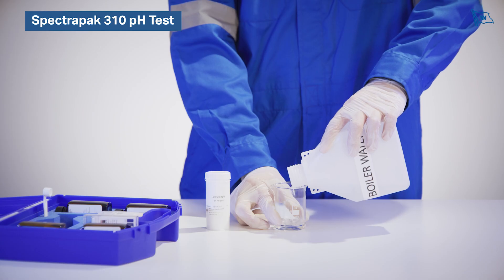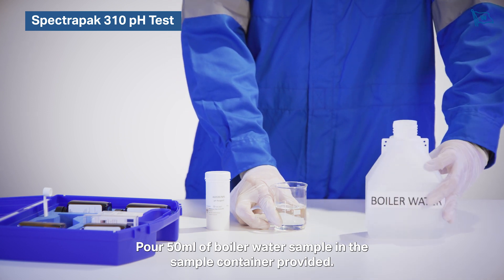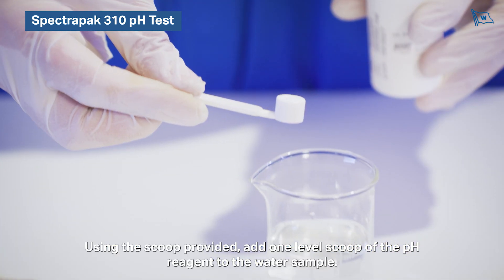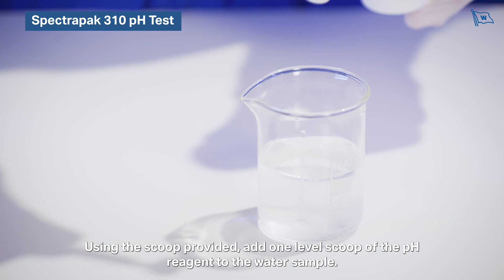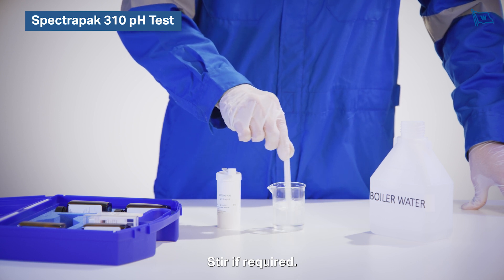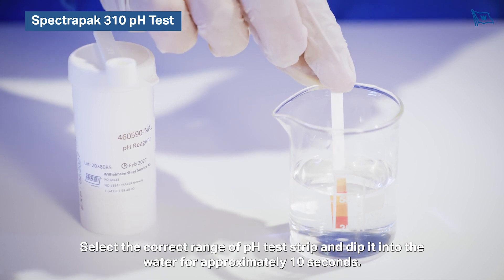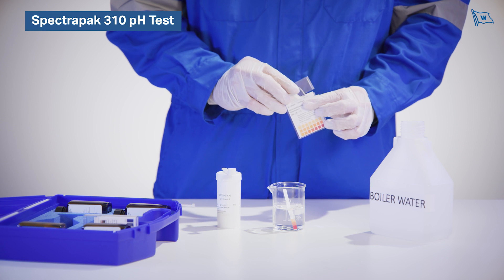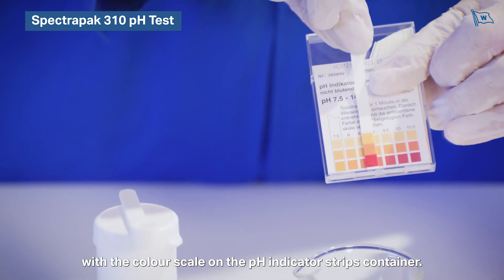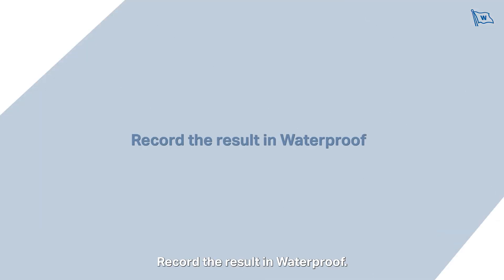pH test. Pour 50 millilitres of boiler water sample in the sample container provided. Using the scoop provided, add one level scoop of the pH reagent to the water sample. Allow to dissolve; stir if required. Select the correct range of pH test strip and dip it into the water for approximately 10 seconds. Withdraw the strip from the sample and compare the colour obtained with the colour scale on the pH indicator strip's container. Record the results in Waterproof.